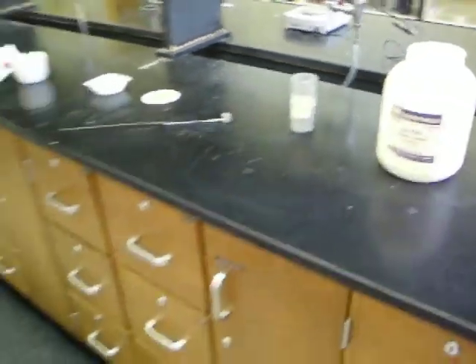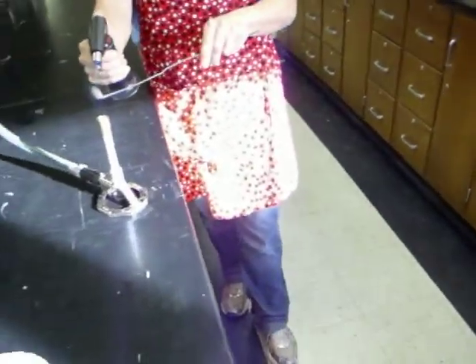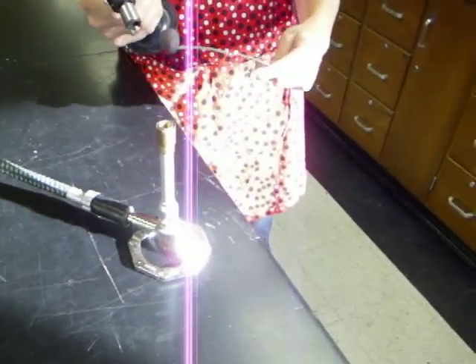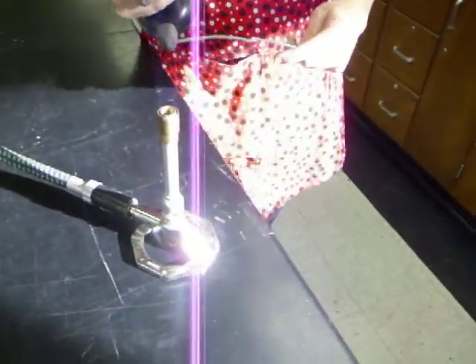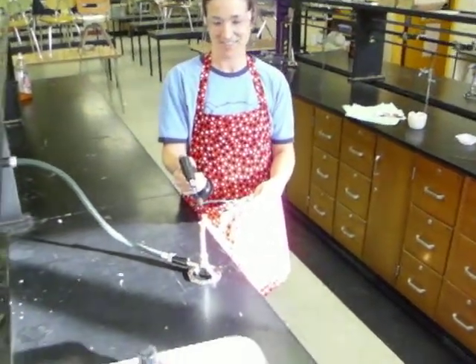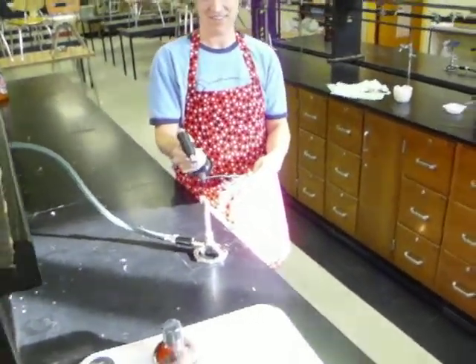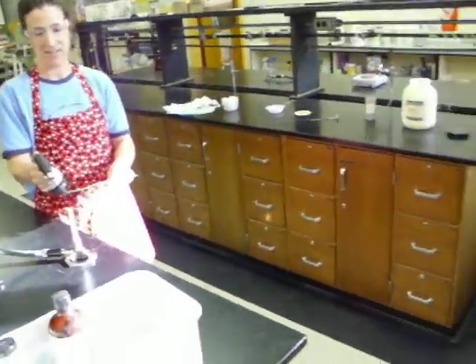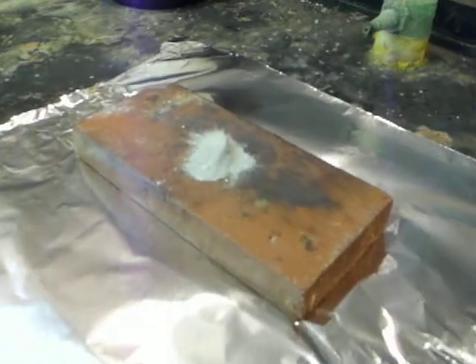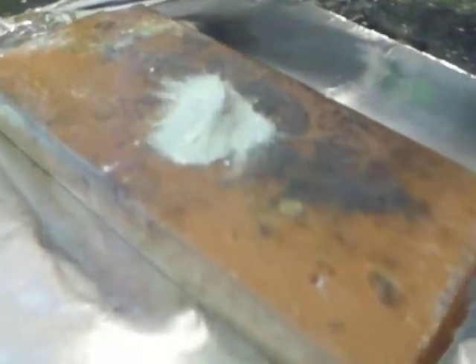And Mrs. Bullock is heating up — what is that thing called? It's called a deflagrating spoon. A deflagrating spoon, getting it nice and hot. And then Mrs. Bullock will walk over to here, and this is where we've got our zinc dust and sulfur ready for reaction.